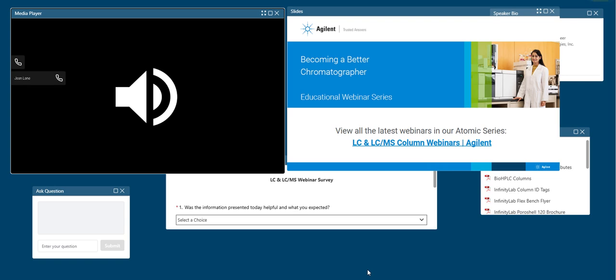If you are continuing to work on that same application, how frequently you might calibrate can vary. We will suggest maybe running an internal standard on occasion, or calibrating weekly would definitely be recommended. If you were changing anything relating to the analysis, if you were putting another column in series, if you were going to a different mobile phase condition, you absolutely would have to recalibrate under those conditions.